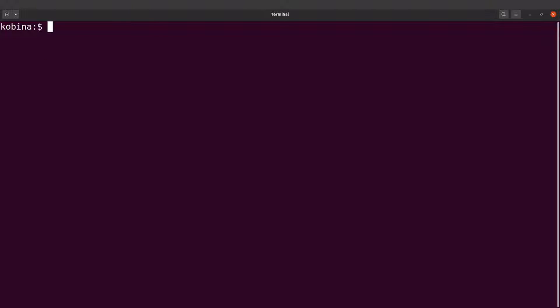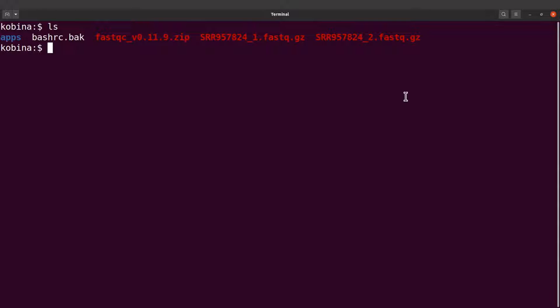Okay, I'm on the terminal now. We are going to run FastQC using the command line approach. I have the data available on my system, so if I do an ls, I'll see them there.